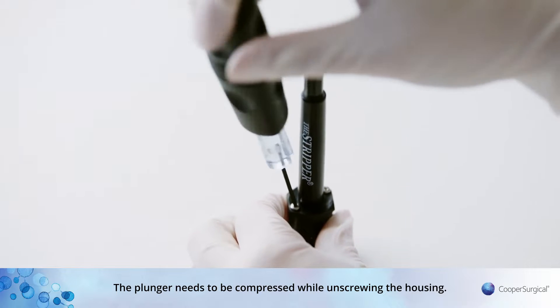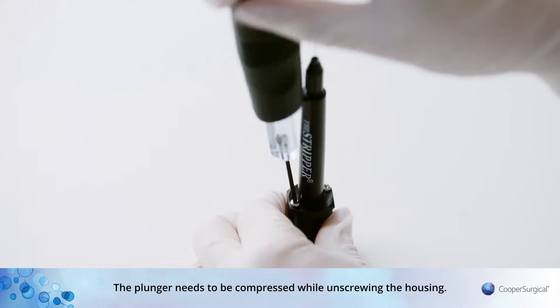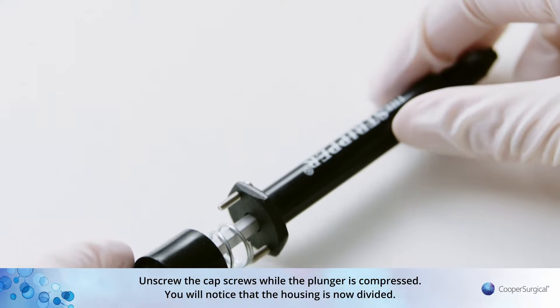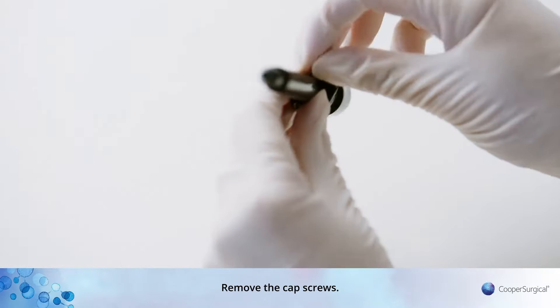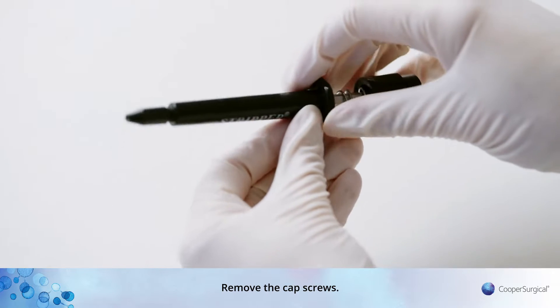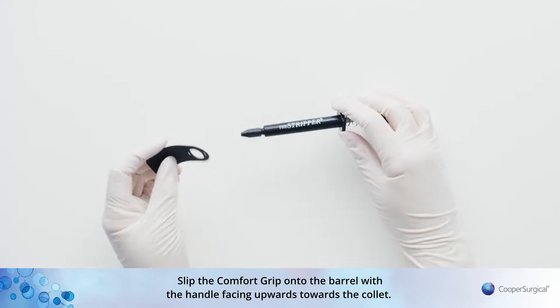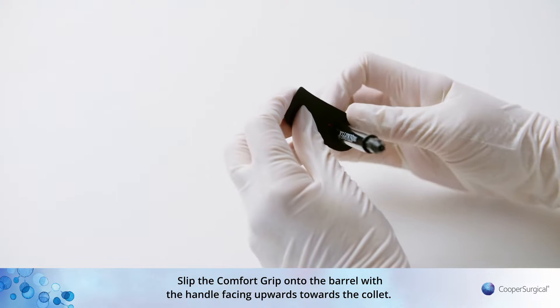The plunger needs to be compressed while unscrewing the housing. Unscrew the cap screws while the plunger is compressed. You will notice that the housing is now divided. Remove the cap screws.